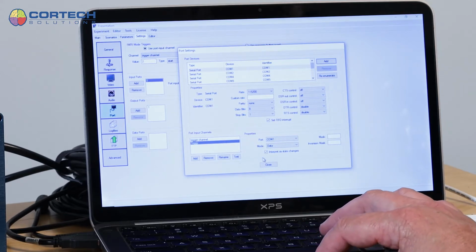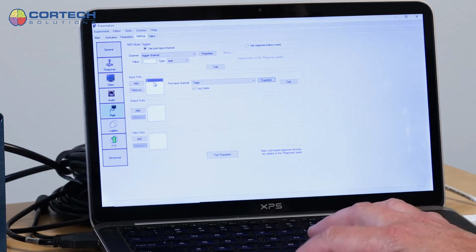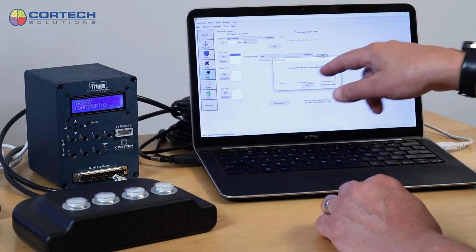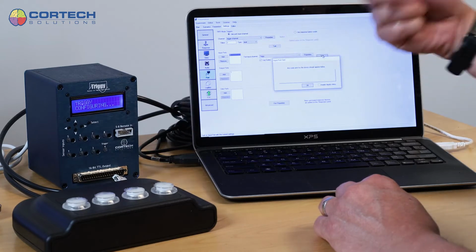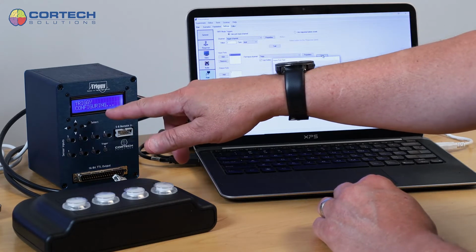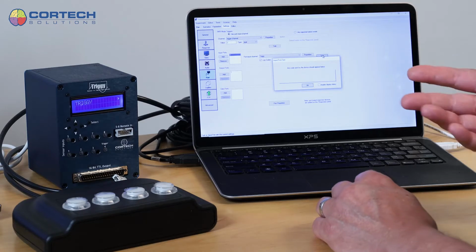So once I've created that and associated it with an input port, Presentation also gives me the option to test it. So when I enable this, you'll see that Triggy resets itself. If you've set the port mode in Triggy but didn't make it the default, it will reboot into whatever the default mode is.